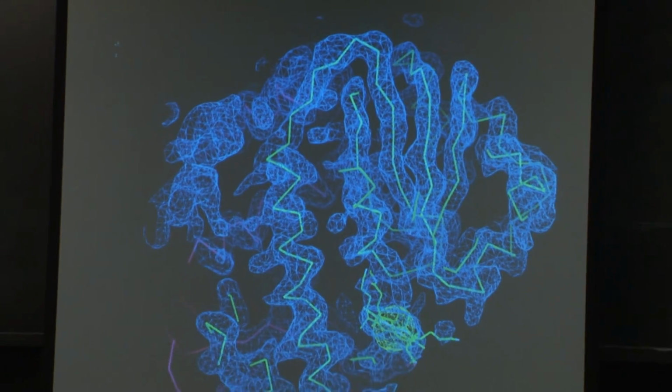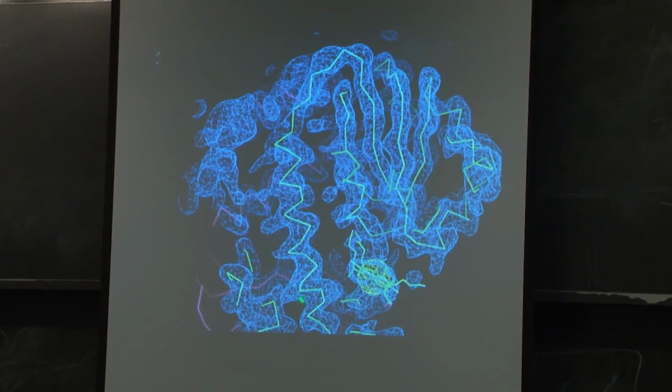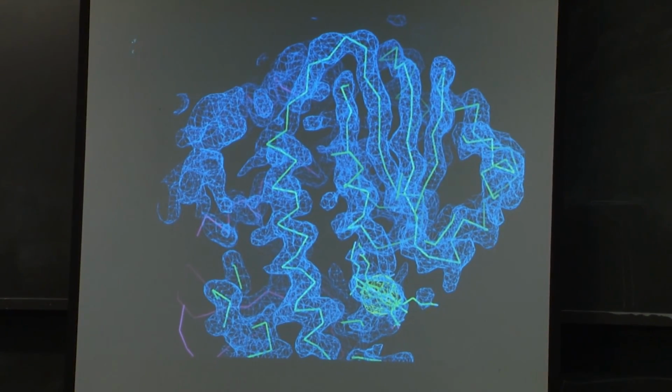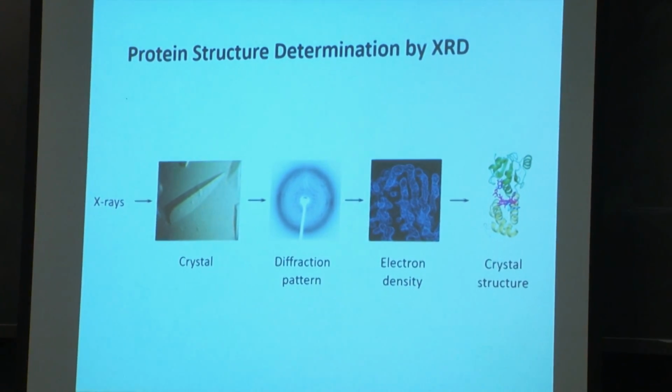And so you know what your protein looks like. You know the sequence of your protein, right? And so then you just take your electron density and fit whatever polypeptide chain you have to that. And then usually, this is all automated nowadays. So you press a few buttons, and software does everything for you, but it was much more challenging early on.